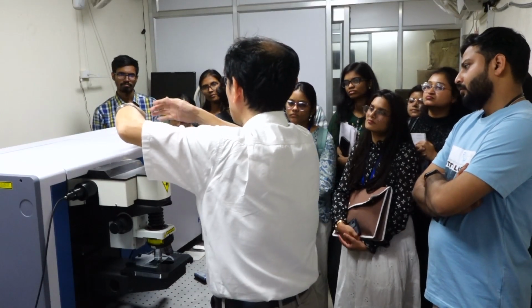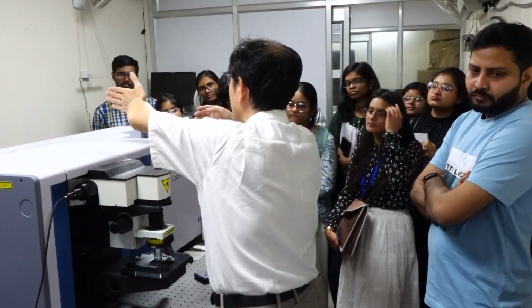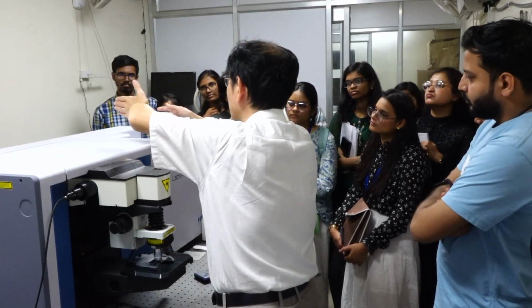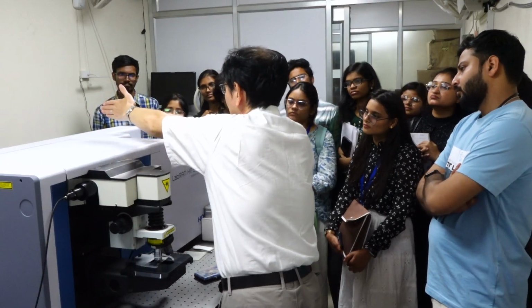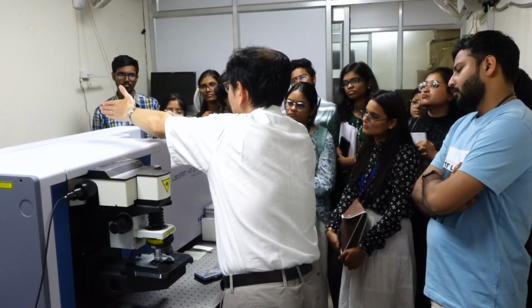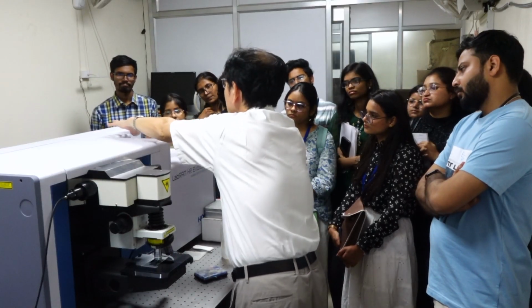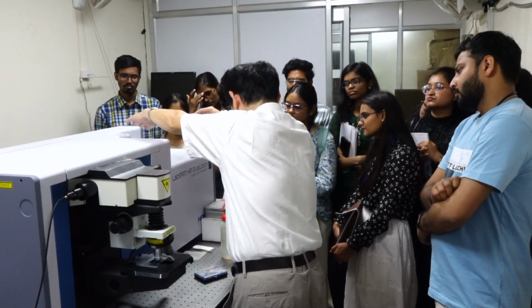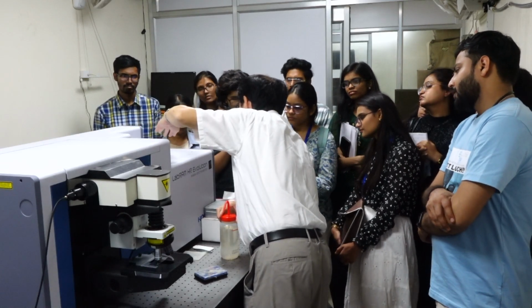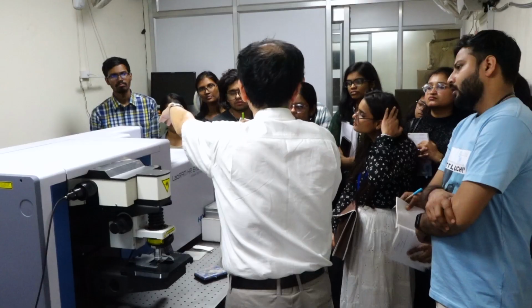Then, by passing the diffraction elements such as a grating, the mixture of the Raman signal is separated into each wavelength and detected by this detector. This is a CCD detector, so it counts the number of photons.